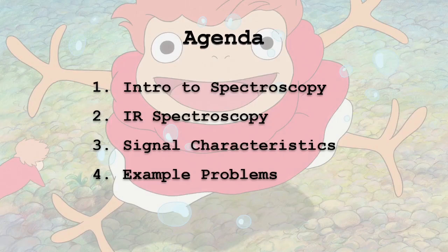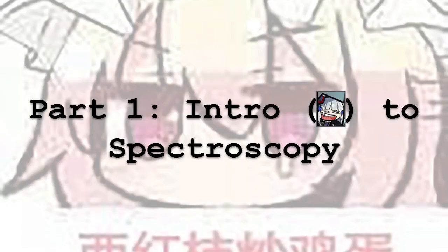So, on today's agenda, I'm going to go ahead and tell you guys a little intro on to spectroscopy. Then we'll go into IR spectroscopy. Then we'll go ahead and talk about signal characteristics. And then we'll go ahead and do some example problems. So, I'm going to go ahead and go over spectroscopy.